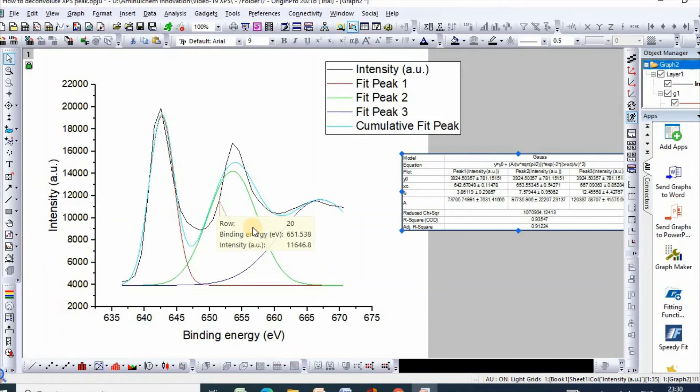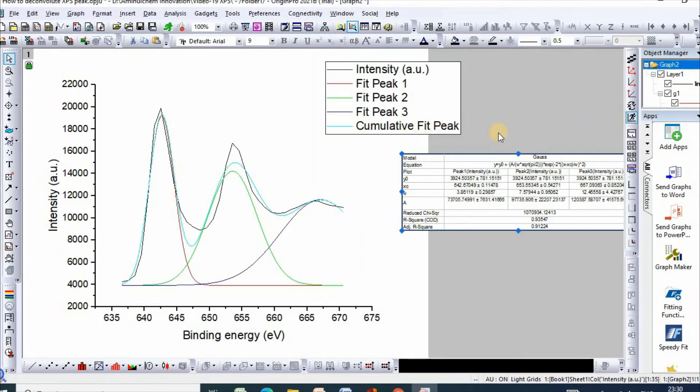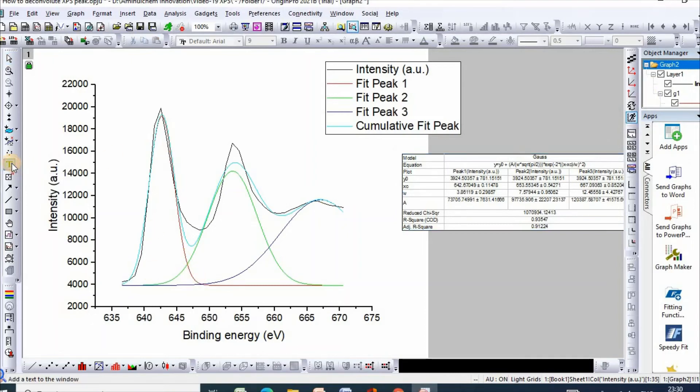The blue one is the cumulative peak. Now you can write text. For example, it is for manganese 2p3/2.